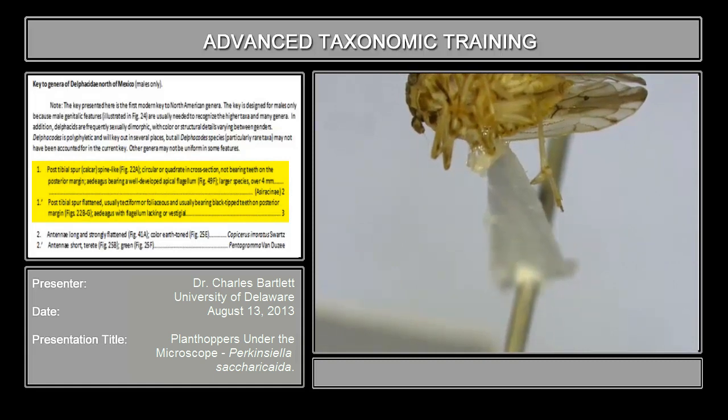So what we have, if you're able to find the spur and reveal it — right here is the spur. It is flattened. There's a row of black-tipped teeth that is a little obscure because I've got to turn it just a little bit to see it more clearly. So this spur is not spine-like, but rather flattened.